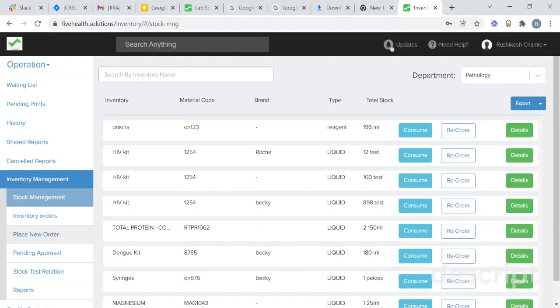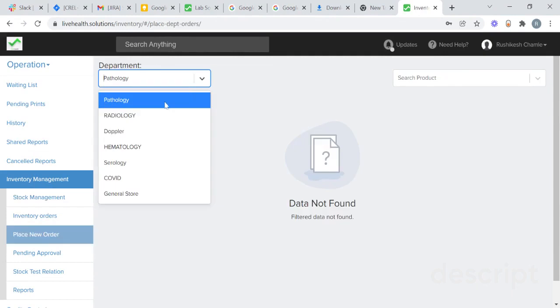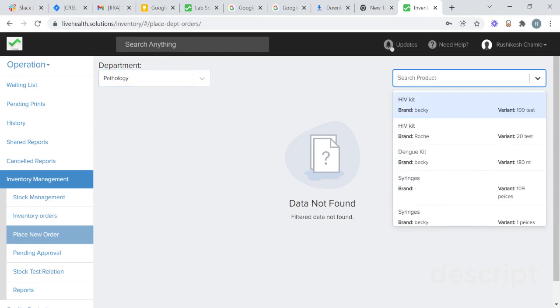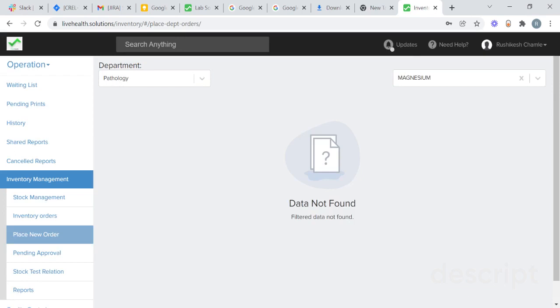From the department, you will also be able to place an order to the store. To place an order to the store, go to place order. Suppose I want to place an order for the pathology department — choose the product you want to receive from the store. I need magnesium. Add the quantity; suppose I want to buy five quantities, and click on place order. This order will be sent to the store.